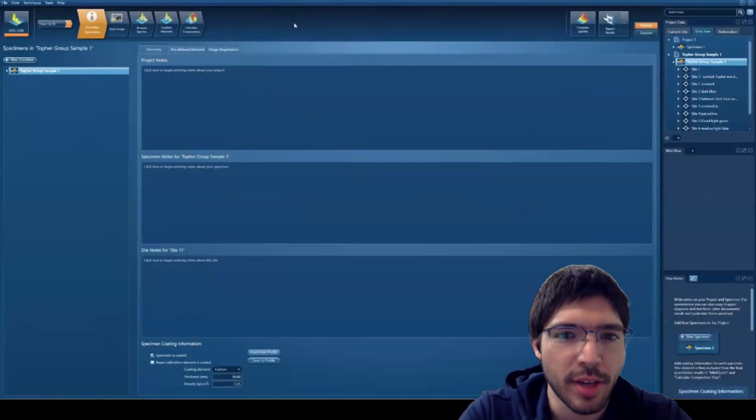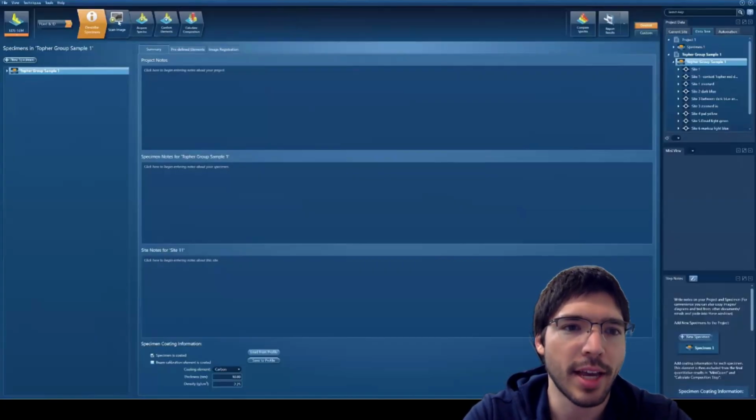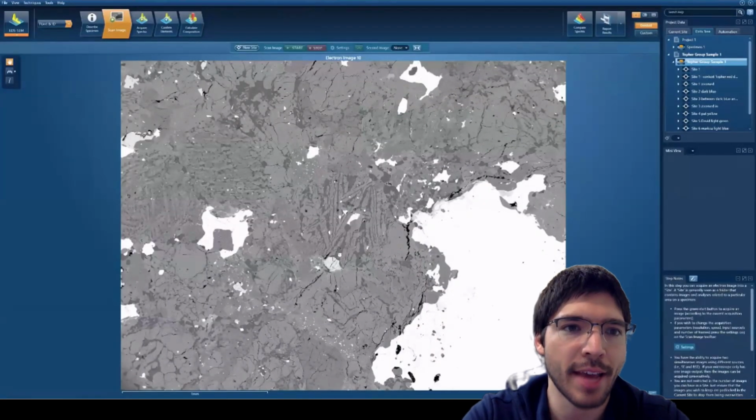Happy to be here. And yeah, part two, we'll discuss essentially how we get the data from the software that we collected it on and then putting it in a format where we can actually start to do some interpretation. So essentially what you're seeing, if you remember, is we collected data on a data collection and processing program called Aztec, or AZtec.